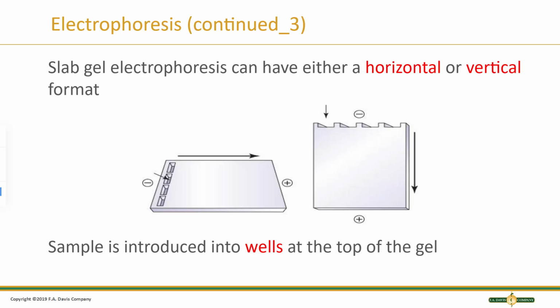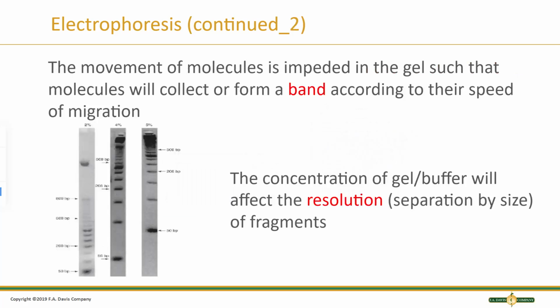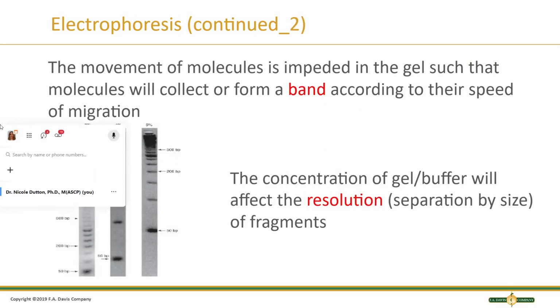So more about how DNA migrates through the gel. DNA strands that are super small can get through a lot faster. Imagine if you come to this party with some kids. Kids are shorter, they're smaller, they can migrate through that crowded room a lot faster, as opposed to an adult, which may take a little bit longer to get through because they're bumping into and trying to get through all of those spaces. So when we have different size bands or different size fragments of DNA, it usually means that they are different sizes.